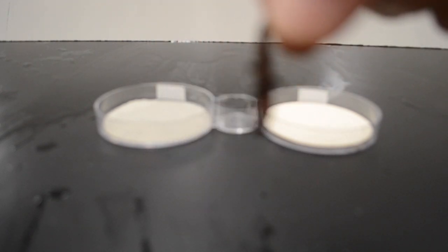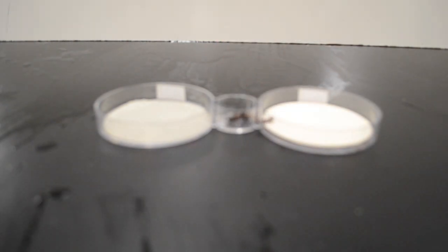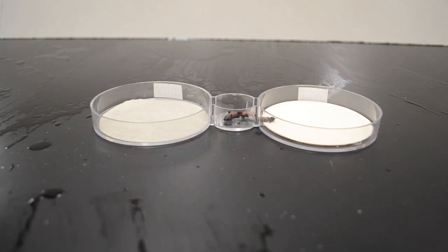And here is a worm. Oh, and I'm going to put this little guy in the middle, and we're going to try and look at which side this little guy goes to. Looks like he's feeling around in there.